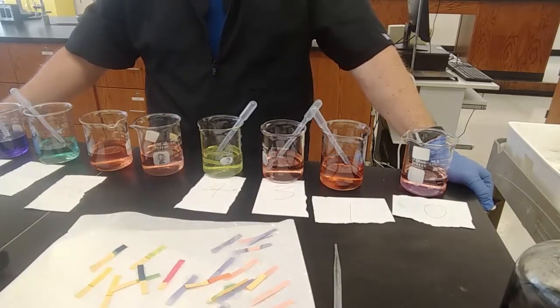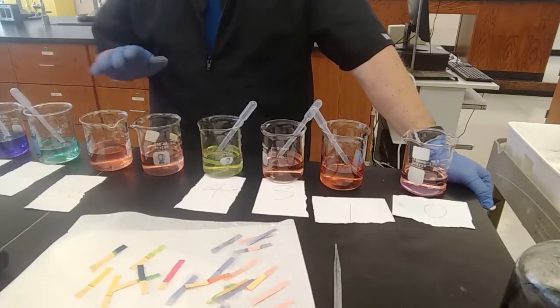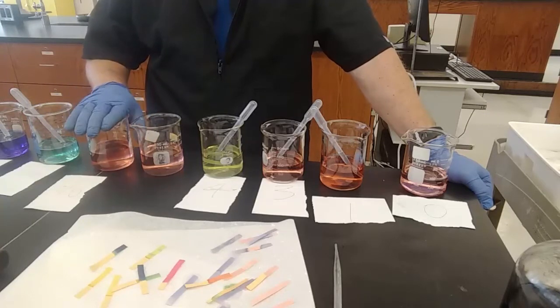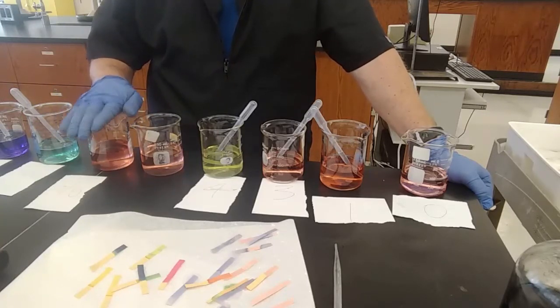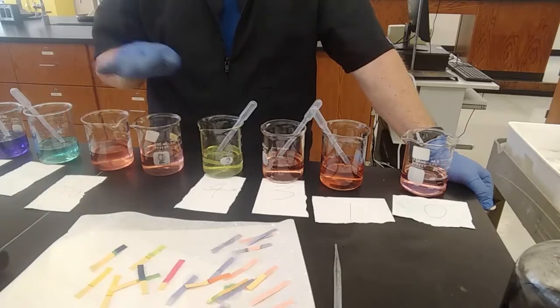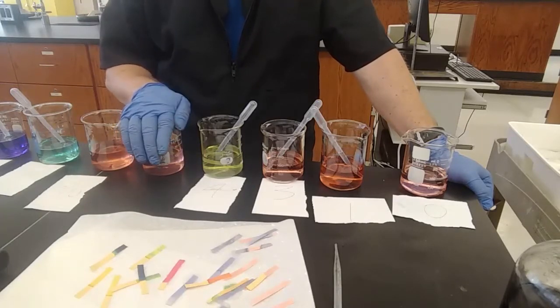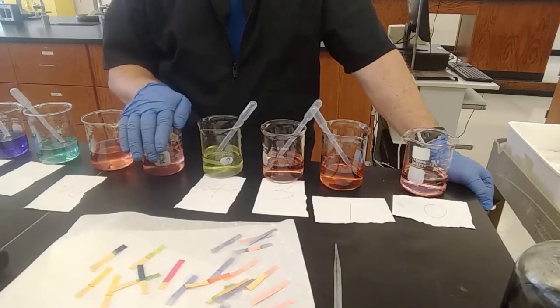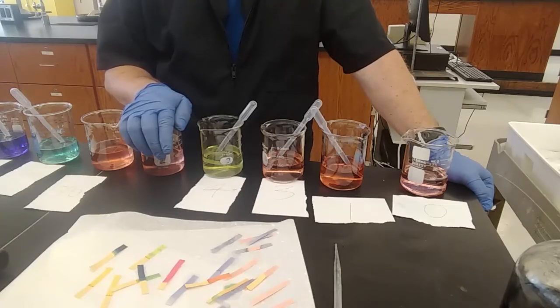What we really arguably could and maybe should have done is gone back and fixed this guy. Right? This is definitely not pH 10. No test that we did said that this was pH 10. Why? Because our pH 7 is not pH 7 either. We used contaminated water for our experiment. That's not good. You should repeat the experiment if you wanted to get precise results. However, I think this is a valuable example in being able to explain anomalous results. And with that, I leave you to discuss the lab further, perhaps with your instructor.